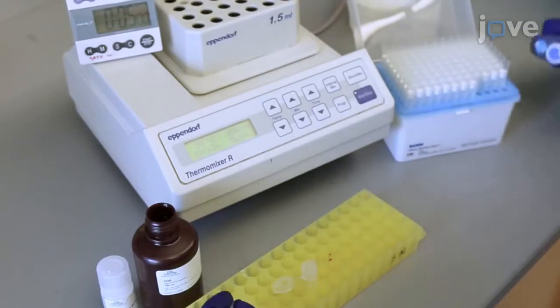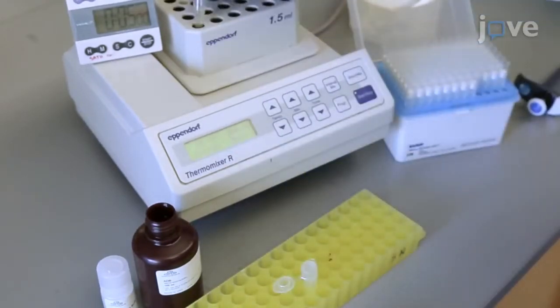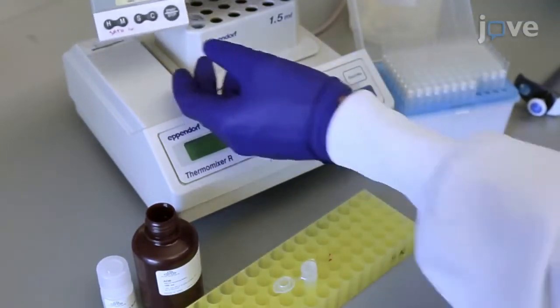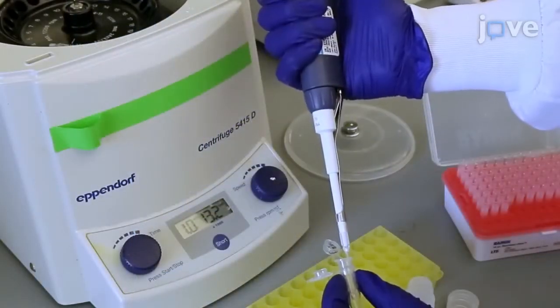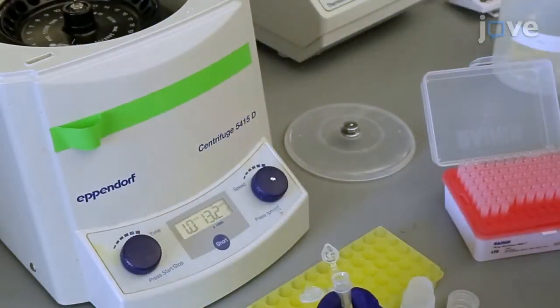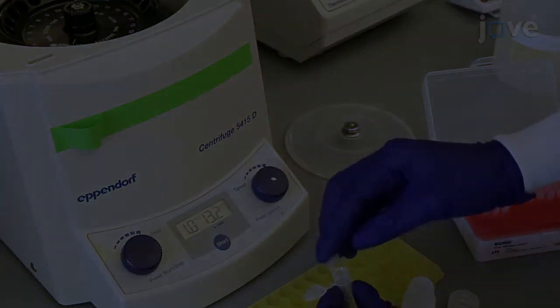Using a commercial gel purification kit, extract the DNA from the agarose gel according to the manufacturer's instructions. Then dilute the DNA into 10 to 15 microliters of TE buffer to obtain a constant 3.5 microgram of the DNA.